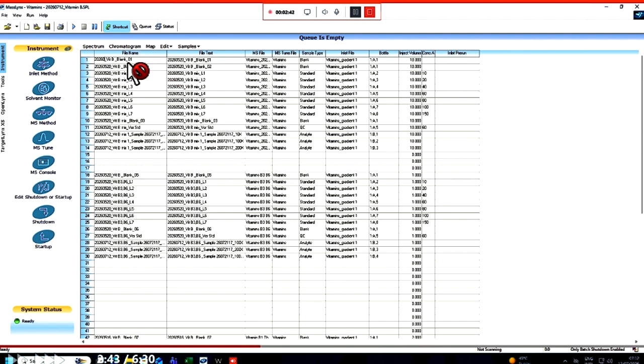Changing the date. The date should be the same in every sample. So you will find your sample in the same file where you saved all the data.